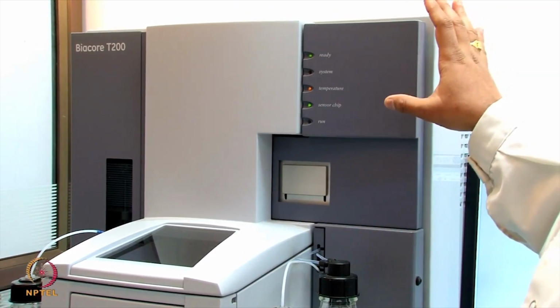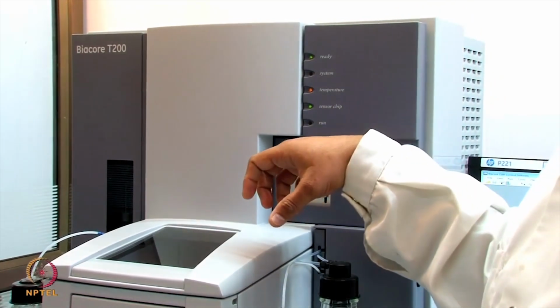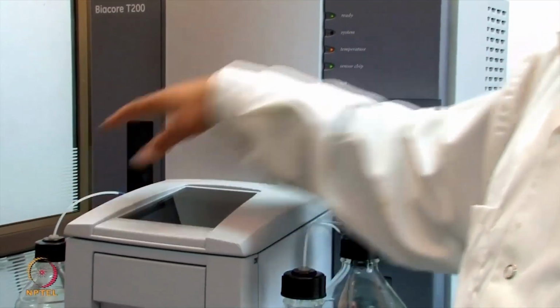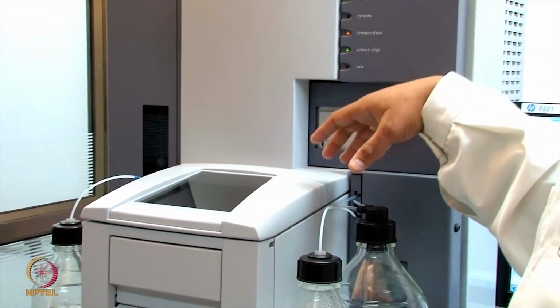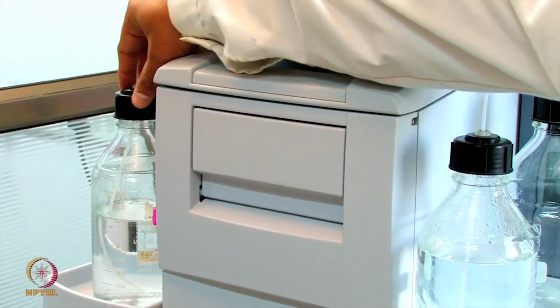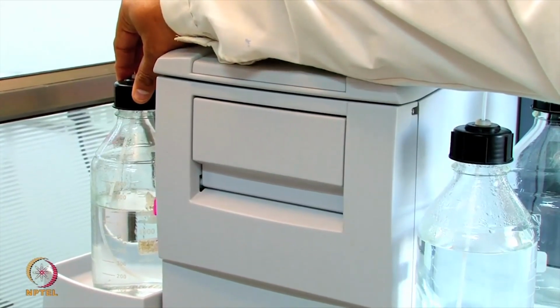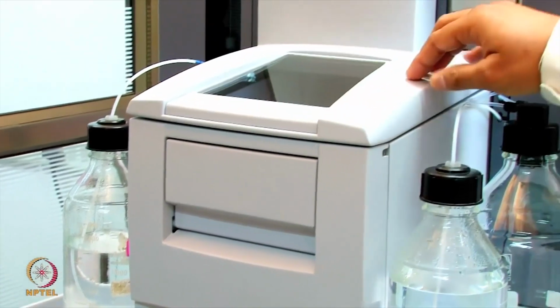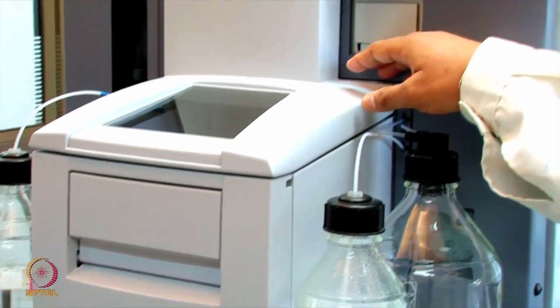So we will now connect a new running buffer here and prime the system before our immobilization experiment. So here the new HBS EP plus buffer is connected and the new chip will be docked now.